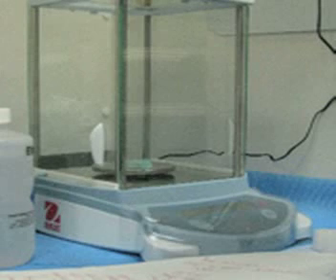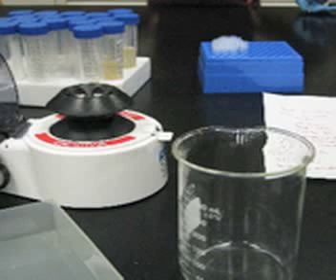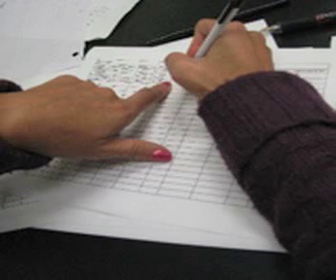And still, the San Francisco Bay Area has a larger number of biotech companies than anywhere else in the world. Tonight, we're growing cells. And what we've tried to do is to grow cells in the same way that a biotech company would grow cells. These are genetically engineered cells that have had a human gene placed inside of them. And we have tricked these yeast cells to make a human protein. The protein that they're making right now, as we speak, is human albumin, which is the most abundant protein in blood.